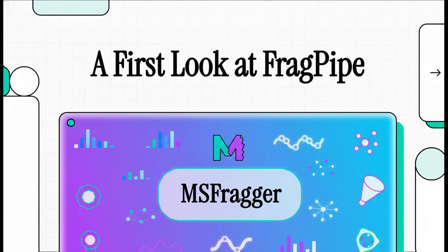Hey everyone, and welcome. Today, we are taking a look at FragPipe, a complete proteomics pipeline that's built around the super-fast MSFragger search engine. If you're working with mass spectrometry data, you're definitely going to want to see this.